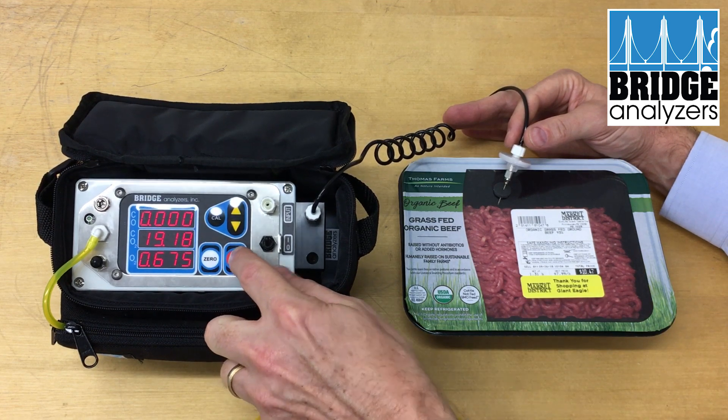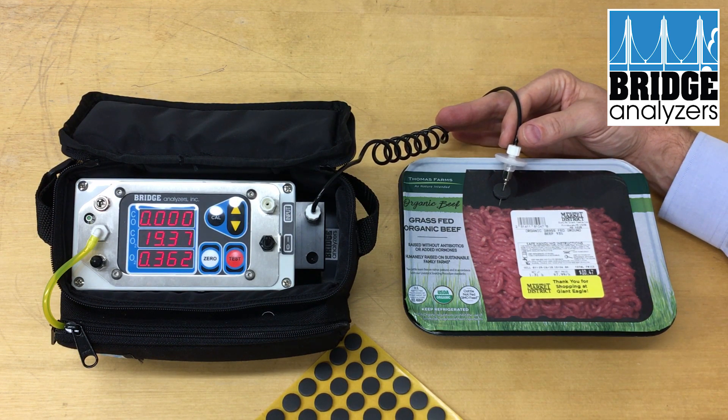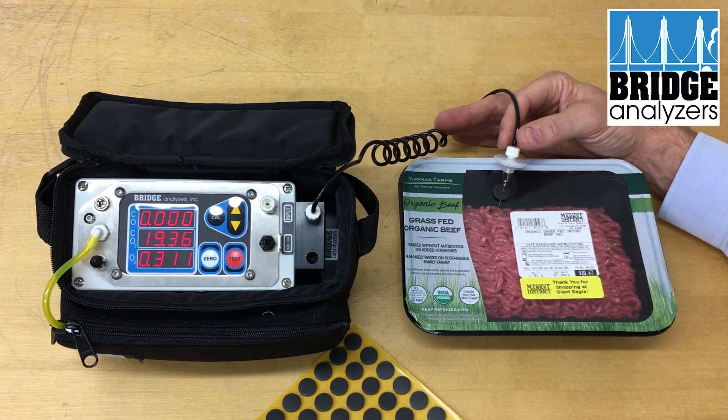If I wanted to double check I could run that test again. After 15 seconds it'll finish again and you'll notice the oxygen keeps going down. It was less than 1% initially, but as that sensor continues to get equalized down at low levels of oxygen it will go down even further. So now we're at 0.3% oxygen and 19.4% CO2, and actually no carbon monoxide in this package.